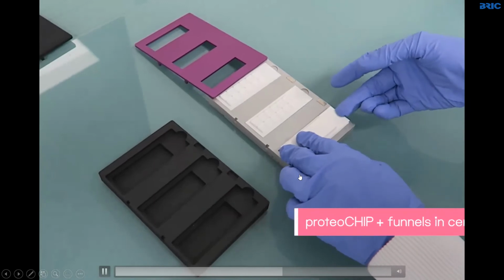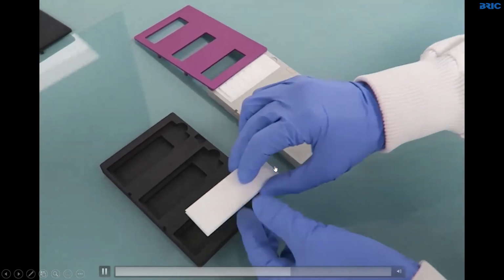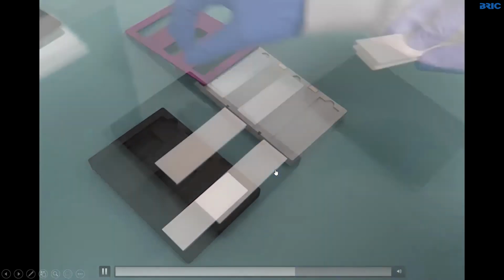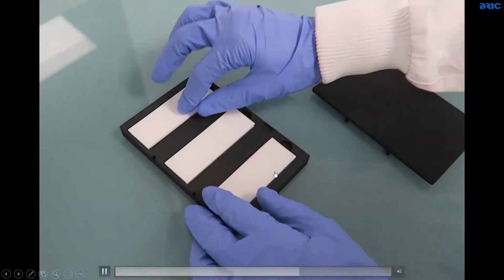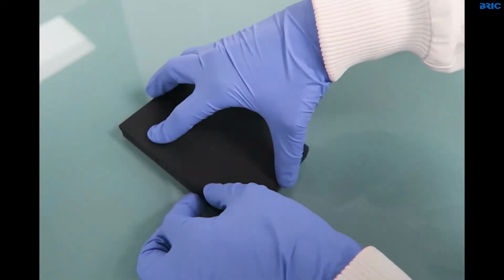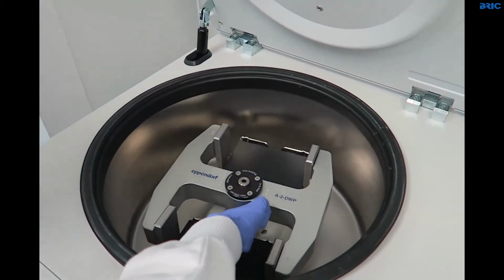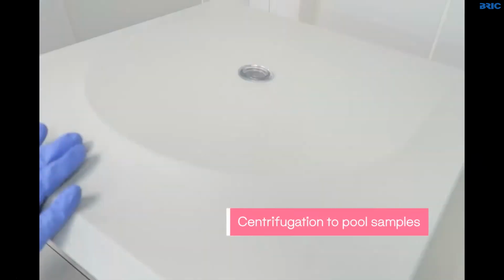We do that by centrifugation. Again, we have those little funnels that are going to come on top of each array. We place that into this little centrifuge holder, then into the centrifuge, we give it a little spin. And basically what you do is you collect the liquid that is contained in those 16 wells into a small funnel.